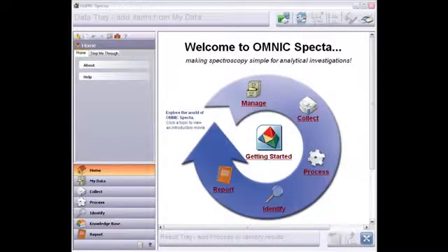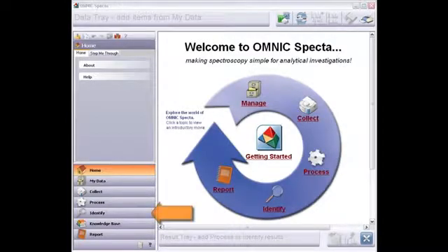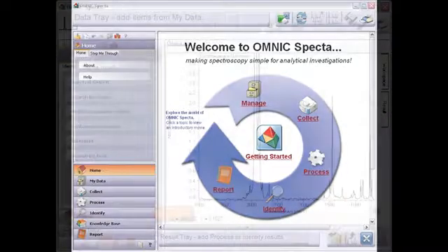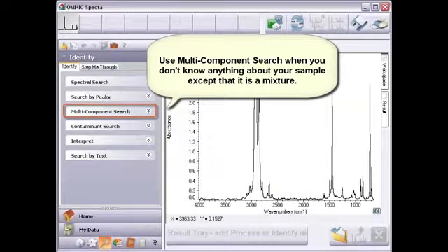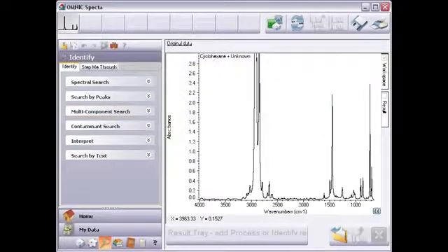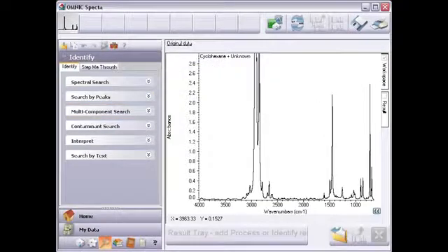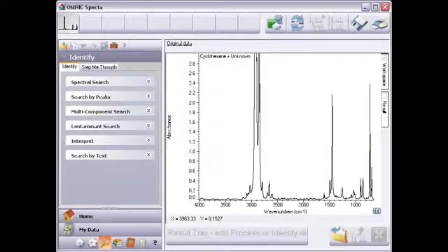All of the search tools are located in the Identify view. Select multicomponent search when you don't know anything about your sample except that it is a mixture. The search algorithm uses an iterative technique to find the combination of spectra that best matches your unknown.